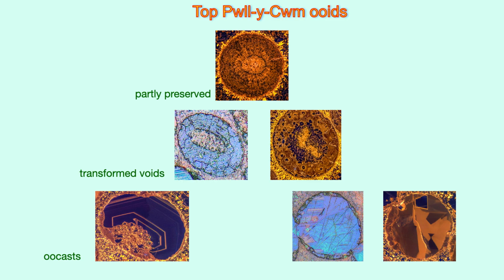A few are like the Baltic ooids, but about half have cortices composed of granular ferroan calcite crystals, and the other half are oomolds. These 2 dominant types occur in groups side by side in the thin section, suggesting fluid access was localized during their formation.